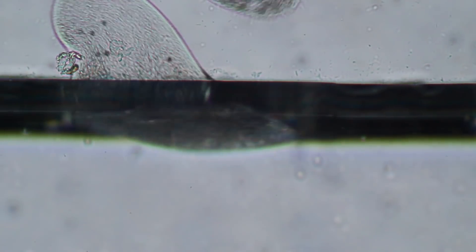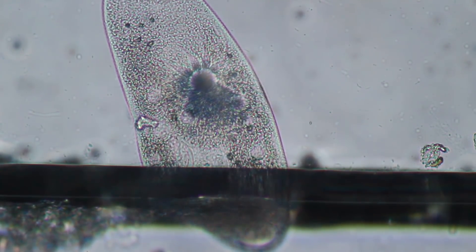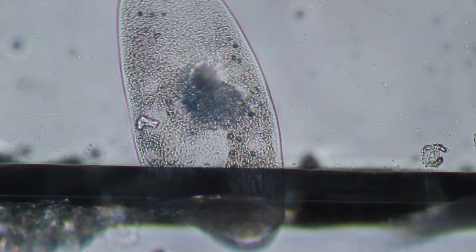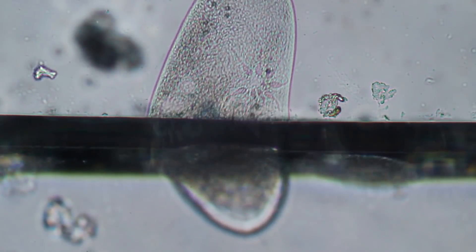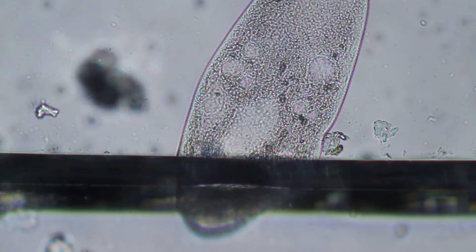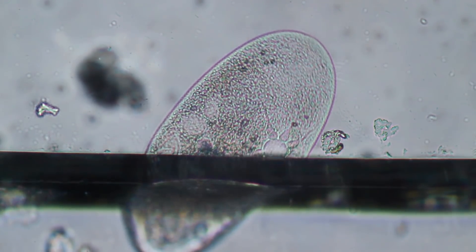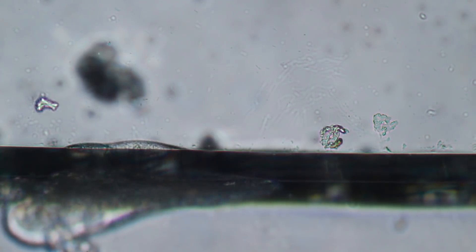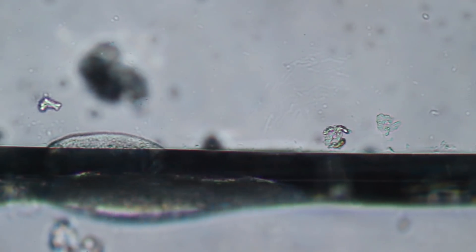And here, this black horizontal line that you see, that is the edge of the cover glass. And you can already see that one of the Paramecia — well, that's our little victim here. This one is caught at the edge of the cover glass and cannot move away. It's trying very hard, but it's stuck. So it decided to run back and forth right on the edge because that's the only movement that was still possible.